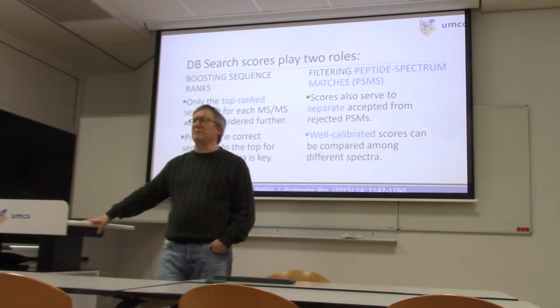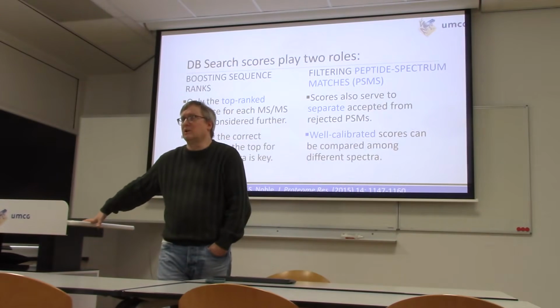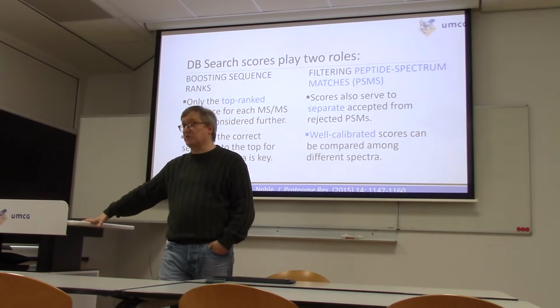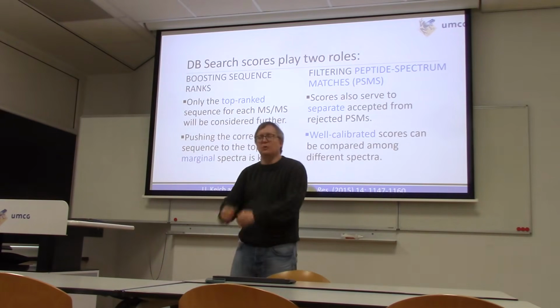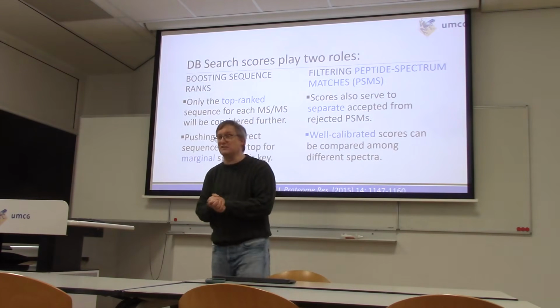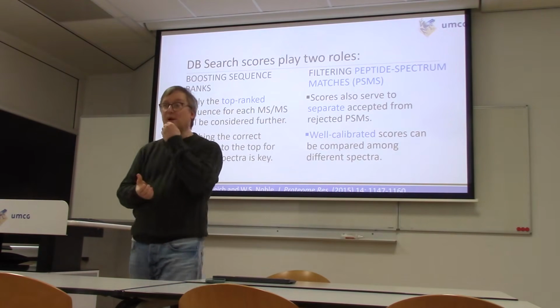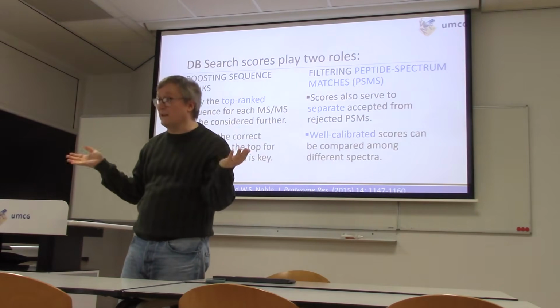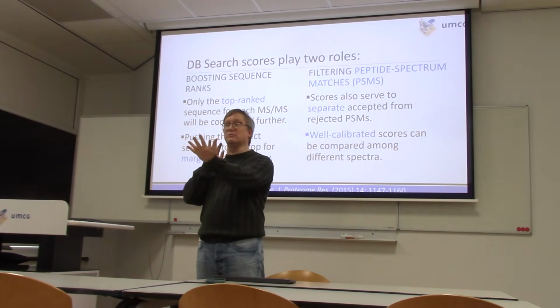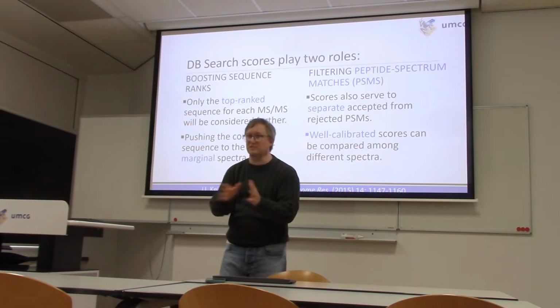You remember that we were talking about a contingency table from a match counting score algorithm, but I want you to remember there are a bazillion ways that you can decide whether the spectrum you predict for a peptide matches one that you've observed in the MSMS. So we need to be a little generic here. Some of the folks doing this are using statistically derived methods. Some people are using methods derived from mechanical engineering. Cross-correlation is a very popular method for comparing an observed spectrum to one you've predicted. There are lots of ways you can go about doing it.